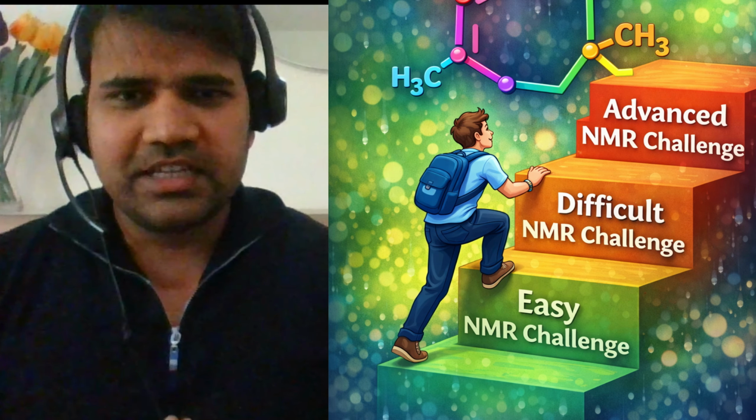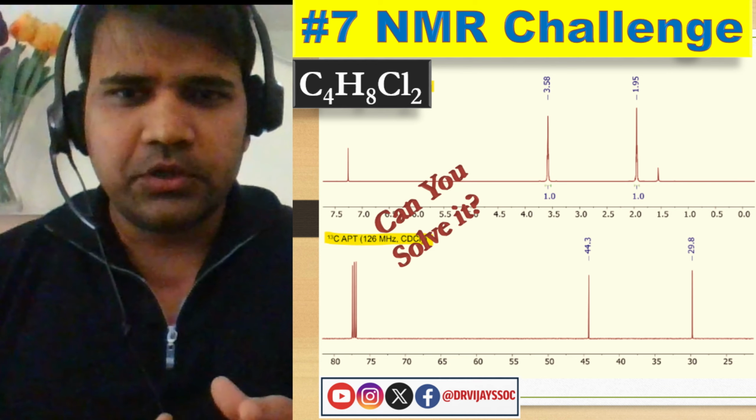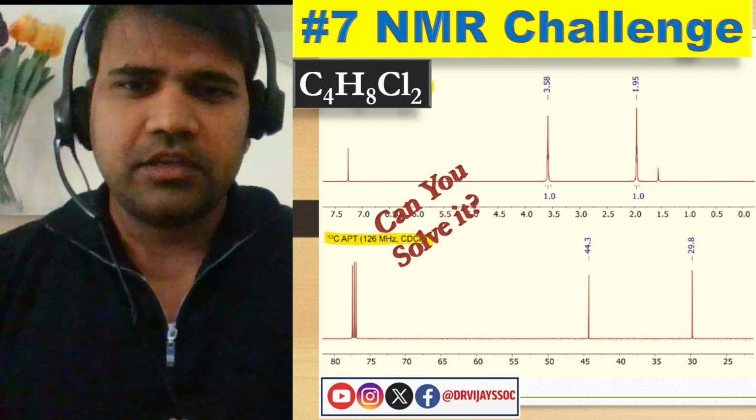Welcome back to the NMR Challenges series. In the previous video, I provided this NMR challenge for you. And today, we are going to explain the solution step by step. If you have already solved it, then you can match your answer by the end of this video. So let's start today's NMR challenge.